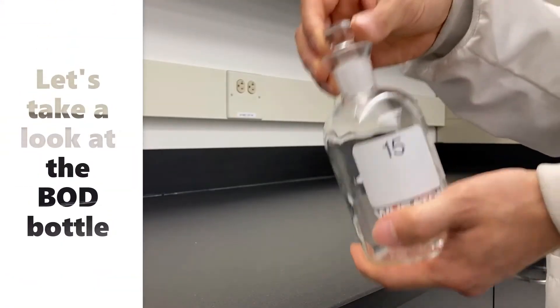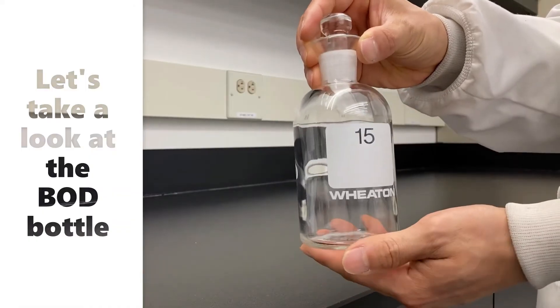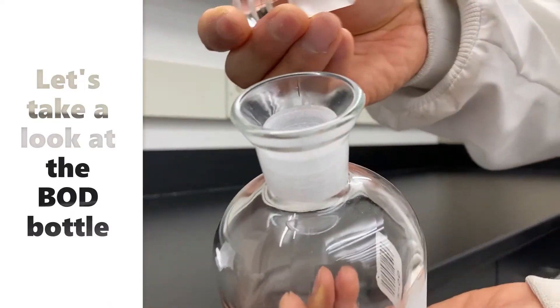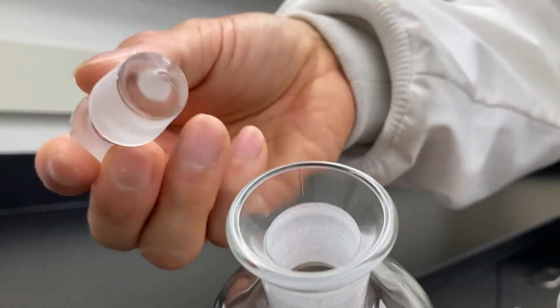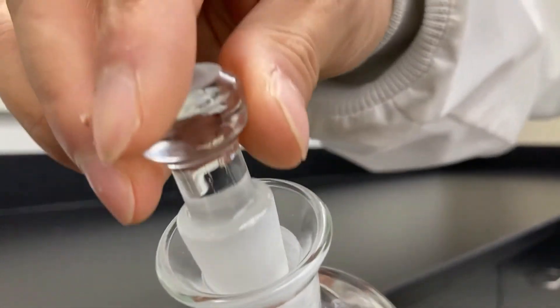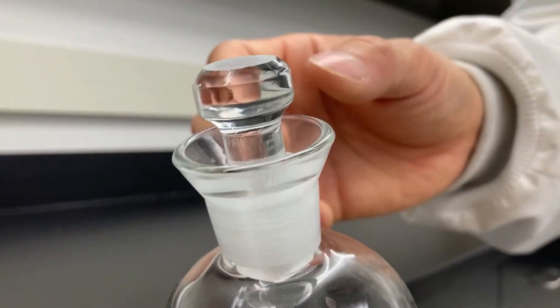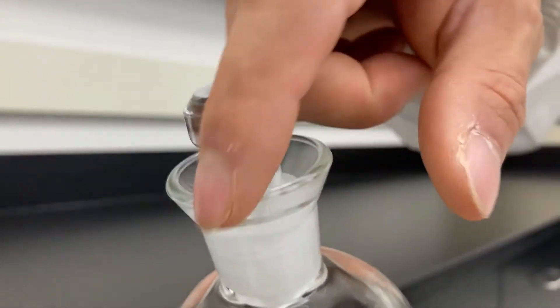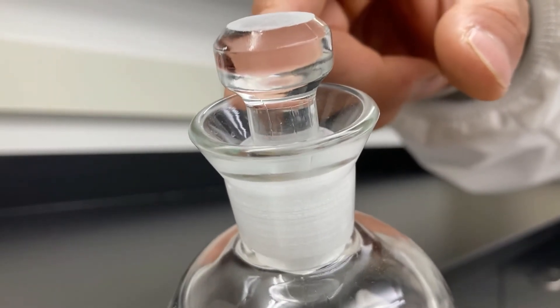So, this is a standard BOD bottle we use for the BOD test. The total volume of this bottle is 300 ml, and as you can see here, the shape of this lid is unique. This flared shape with this lid is designed for airtight seal in a traditional way because we don't want to have oxygen supplements from outside of this bottle. You can use water around here to prevent oxygen intrusion into the bottle during the test.